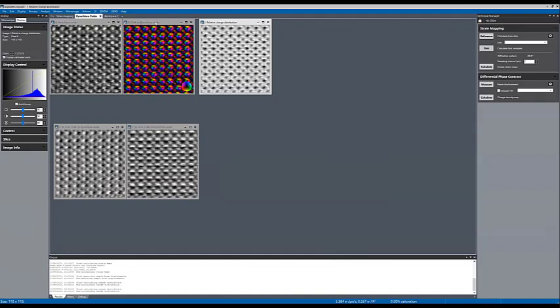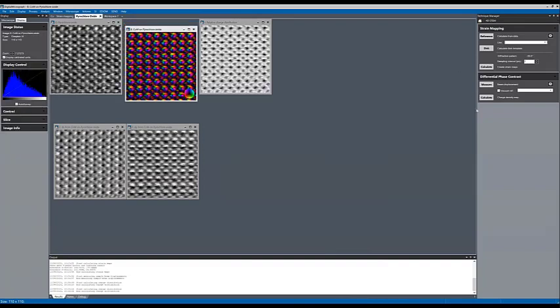Now, another thing which I think is going to be, again, a good opening for the next session is that whatever I showed you so far is what we have implemented in DM. So simplified, easy to use analysis tools for different types of 4D STEM data sets. But you have the possibility of writing DM scripts or Python scripts in Digital Micrograph as well.